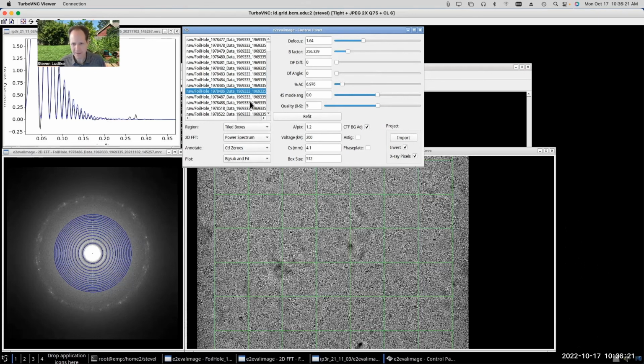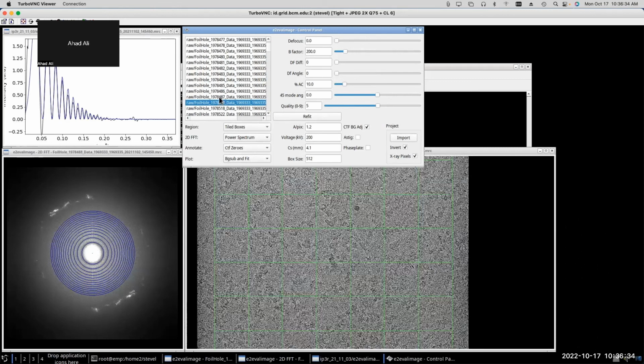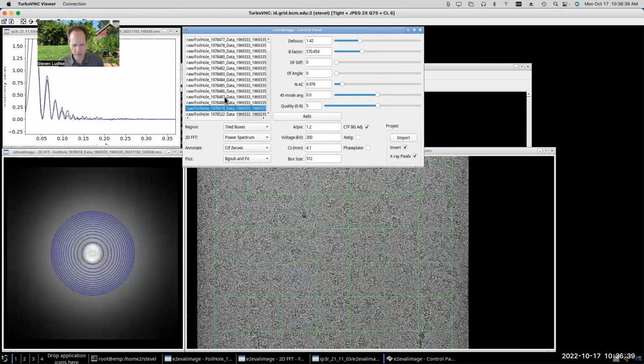It's okay. Yeah, I had a question. So besides sampling at different defocus points, why does noise increase with increasing spatial resolution, or spatial frequencies rather? Why does the noise increase? Well, it's not so much that the noise is increasing, it's that the signal is decreasing. So the signal to noise ratio decreases with spatial frequency, but it's not because there's more noise, it's because there's less signal. And that's basically optics.